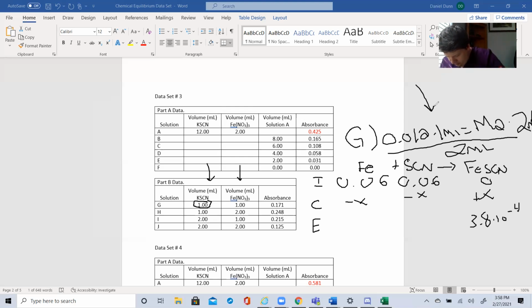So 0.06 minus my concentration I calculated. And that's got something akin to 0.059. Now that's not the end of the world. It's pretty good, 0.059. Not very high, but it will change over time, trust me. So boom, boom, boom, boom, that's going on there.